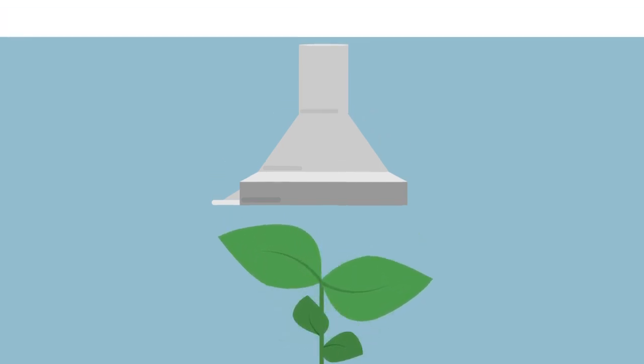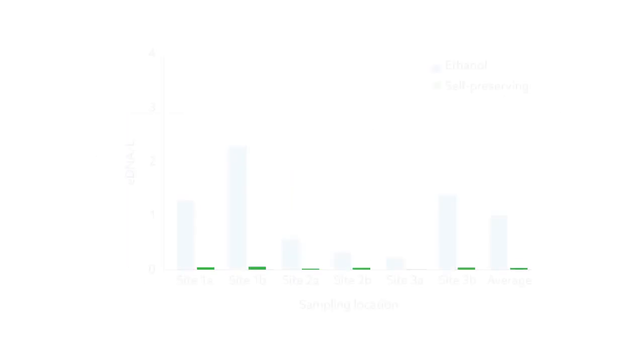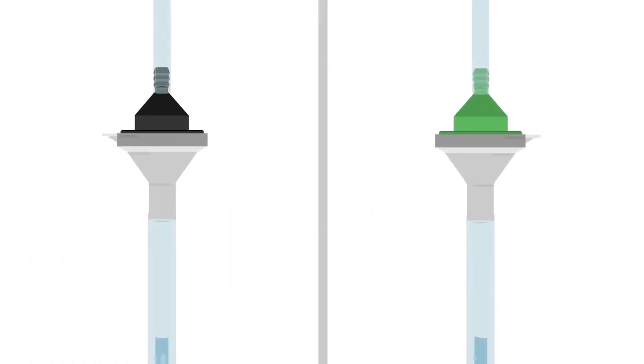sampling approach. Tests in the lab and the field showed that both ethanol and the desiccating filter housings could effectively preserve eDNA for 6 months, with the self-preserved filters performing a bit better. The self-preserving system yielded slightly more target DNA on average under controlled conditions, and up to twice as much eDNA per liter in the field. These differences could be due to the loss of captured eDNA to the ethanol preservative when the filter is removed for processing, or due to the different filtration dynamics of the two filter housing materials.